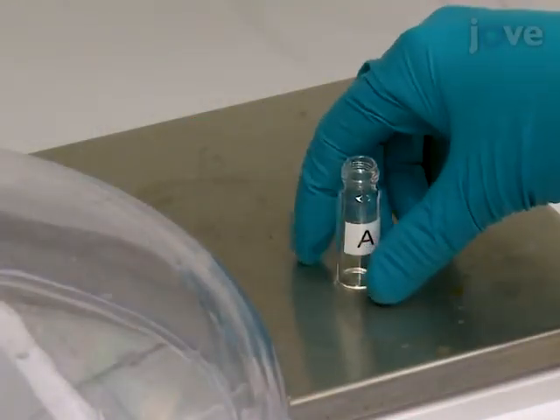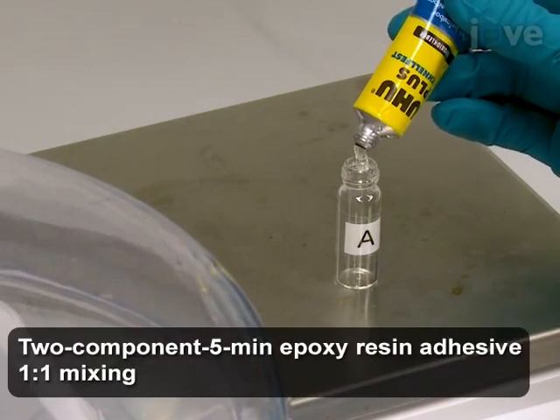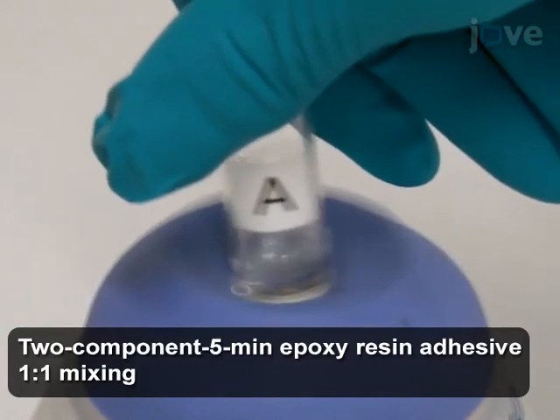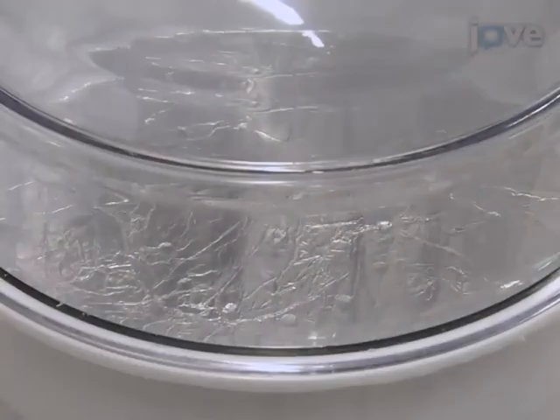To begin the chip fabrication, dilute the precursors of a two-component epoxy resin with ethanol to a final ethanol mass concentration of 40% by weight. Using a Vortex mixer, mix epoxy resin and ethanol together. Degas the PDMS mold in a vacuum desiccator for 150 seconds.